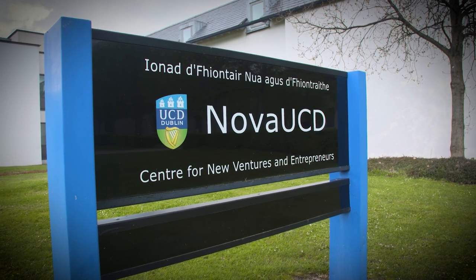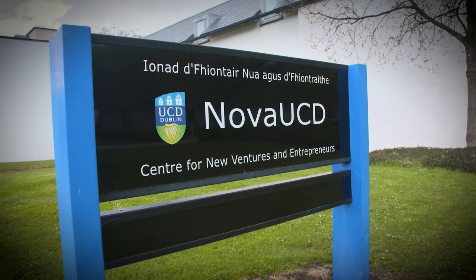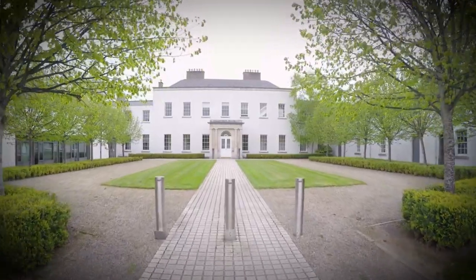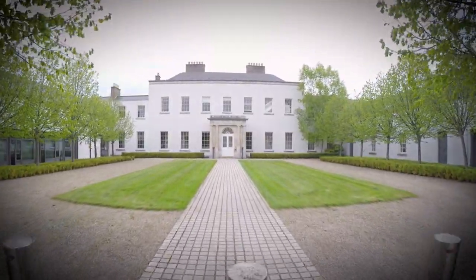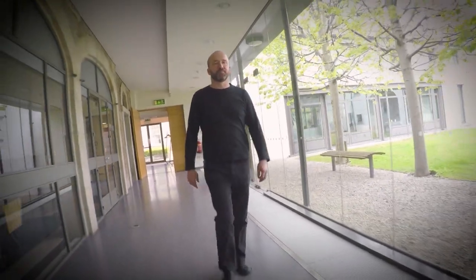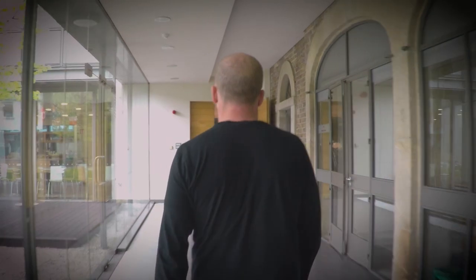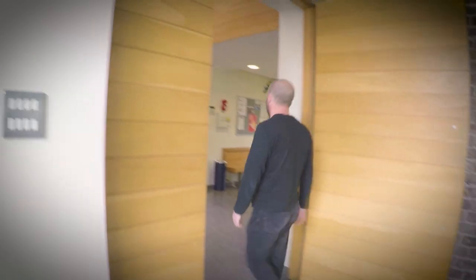This bioprinter is a team effort — myself, Emmanuel Reynaud, from a biology point of view, and also Brian Rodriguez for physics. It's physics, engineering, and biology working together. We have been supported by Enterprise Ireland and Science Foundation Ireland from the start through the last three years, which means we now have a prototype.